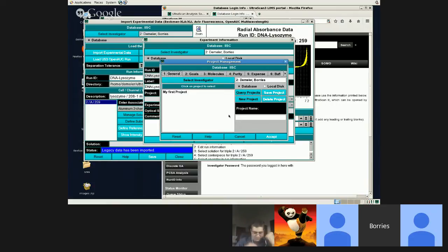It's a really nice thing to have, especially if you collaborate with other users. There are so many projects worked on with collaborators who come back years later and say, well, we finally solved the structure, now we want to publish. Or, what about that AUC data you collected 2 years ago? Do you still have that?